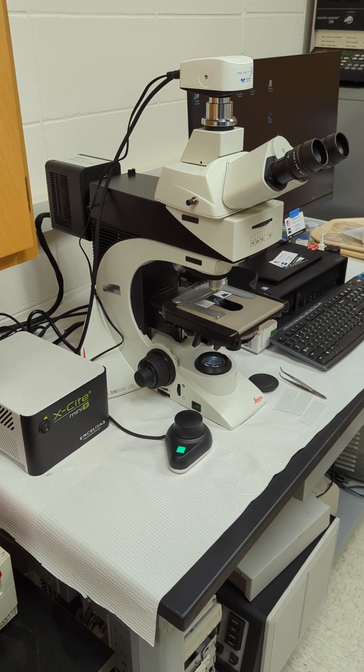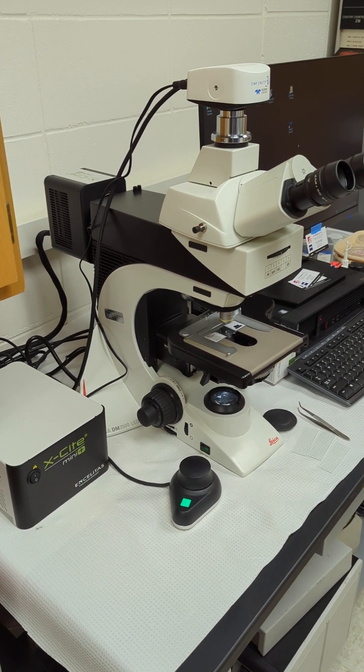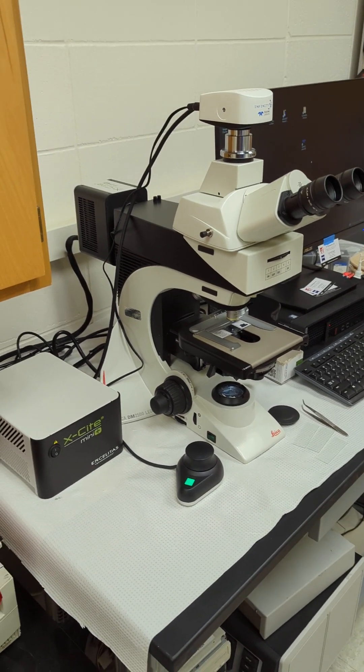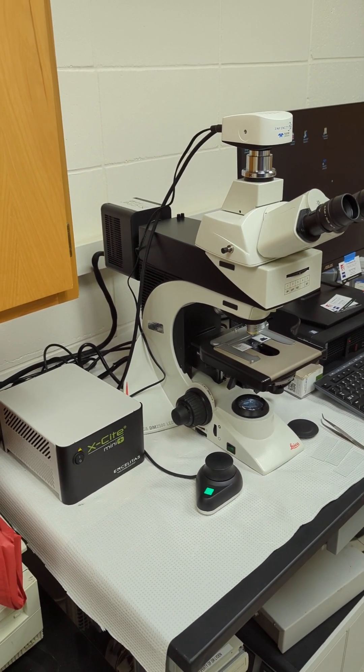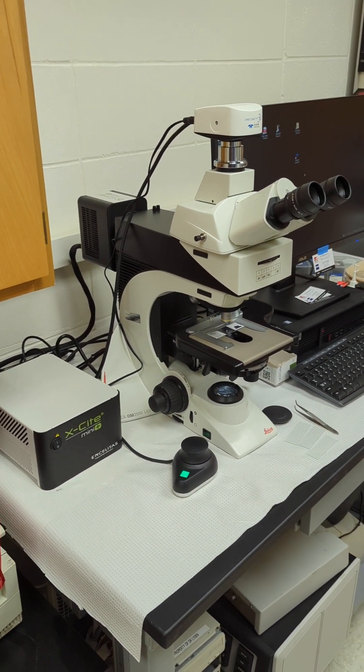This is a brief introduction to the DM2500 research fluorescence microscope at UWRF.